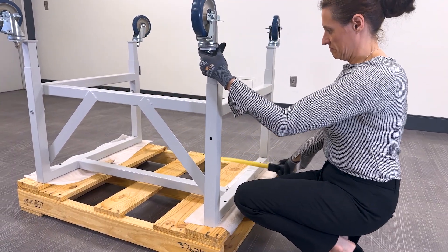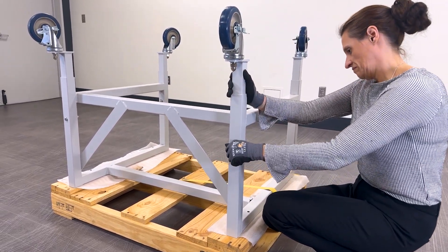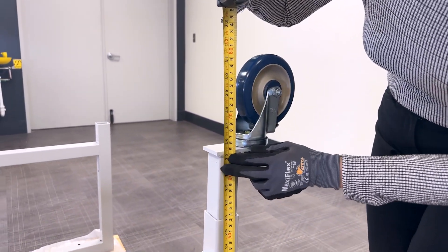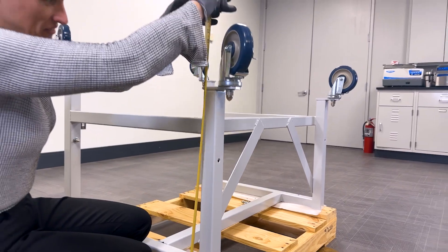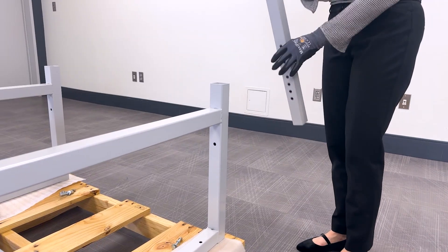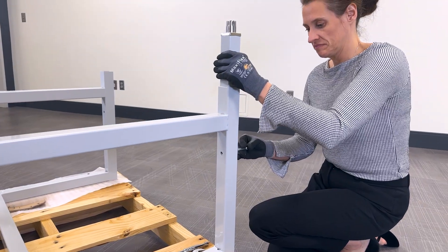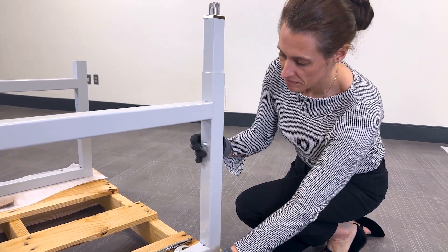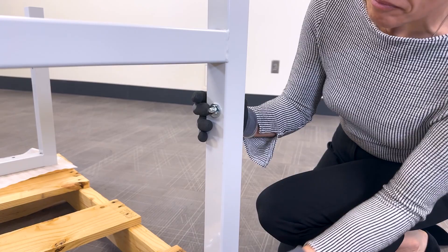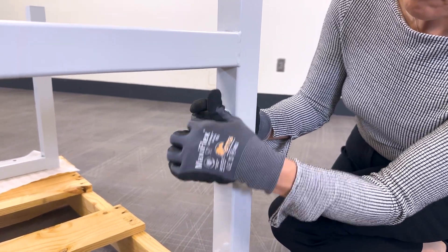You'll install the legs while the base stand is still secured to the pallet. The telescoping base stand can be adjusted to accommodate a final height of 27.5 to 34.5 inches, adjustable in 1 inch increments. Determine your desired work surface height — remember that the work surface will add around 1 inch of height. Next, slide one leg extension into the base stand corner post and attach with a 5/16 inch by 2.25 inch long bolt, flat washer, lock washer, and acorn nut as shown. Ensure that each acorn nut faces inward.